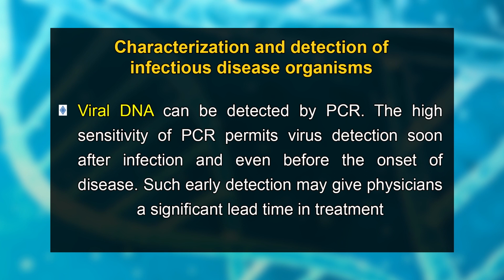Viral DNA can be detected by PCR. The high sensitivity of PCR permits virus detection soon after infection and even before the onset of disease. Such early detection may give physicians a significant lead time in treatment.